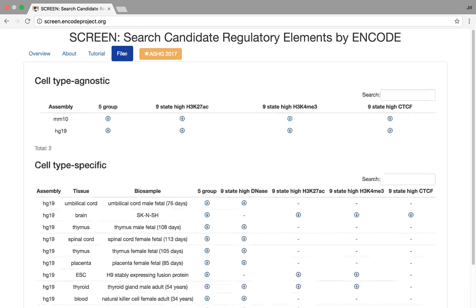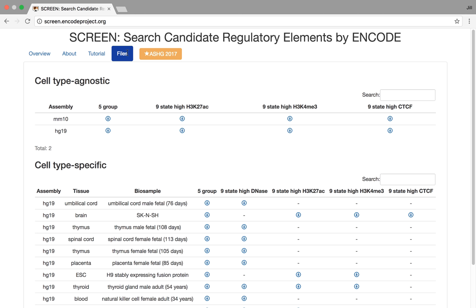And the last part is, well, where are these CREs? This Files tab actually has a download link to all of the CREs, both the cell-type agnostic that Jill talked about, as well as the over 700 different cell types we have across human and mouse, broken down by five groups in nine states.